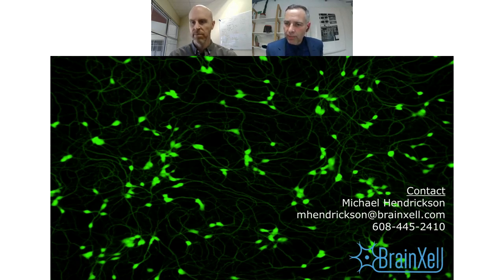So you was asking, can you comment on the utility of 2D versus 3D iPSC neurons in drug discovery? Essentially the current practices and maybe future looking trends in those kinds of techniques. So that's a good question. Current practices, at least from the groups we work with, our customers, our collaborators, it's mostly 2D. I think that's because of the challenges of the readout in 3D, not necessarily generating the cultures. I think that's relatively well established, but the readout, whether it's imaging or other assays, there's more variability there. The readout is much more challenging than in a 2D system.